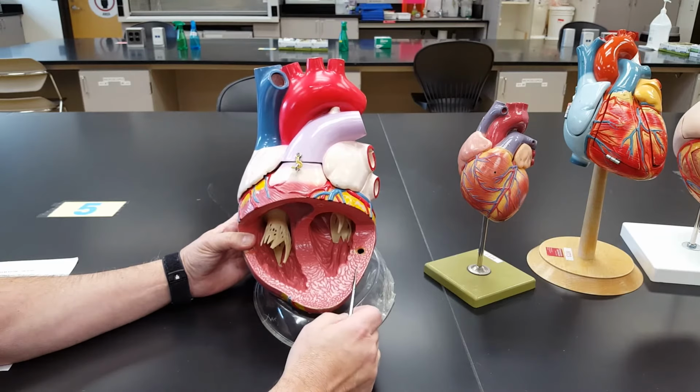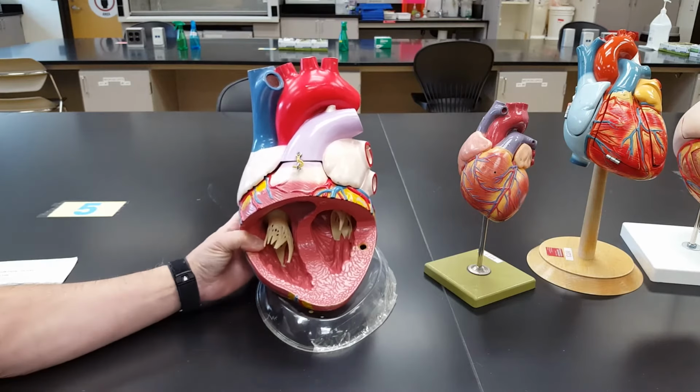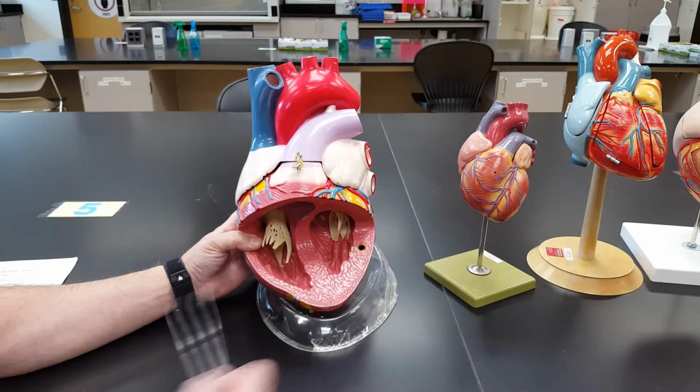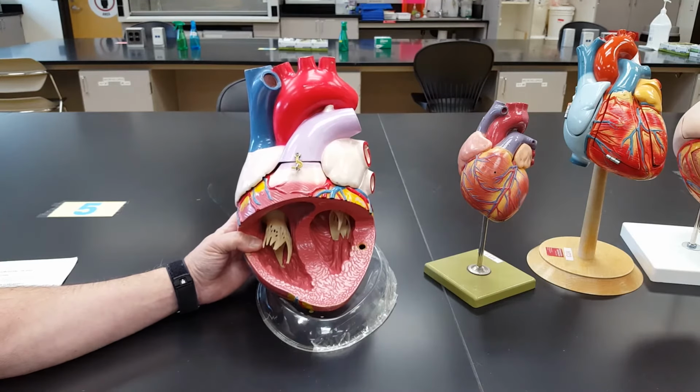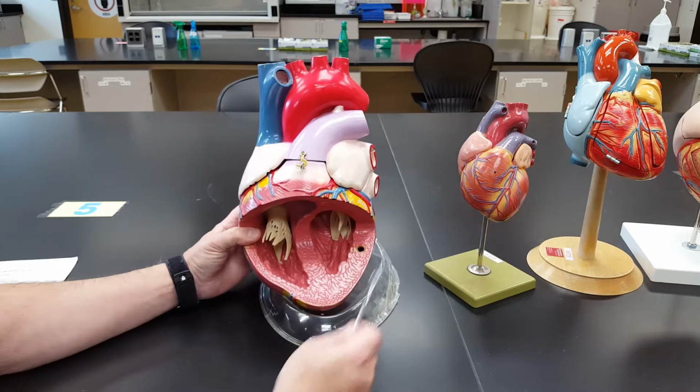I always recommend that you begin with the myocardium, which of course is more than 90%, about 95% of the cardiac wall is myocardium right here. So this is the muscle, myo, M-Y-O, meaning the muscle. So the myocardium is this thick layer right here that you see composed of those cardiac muscle cells you learn about and talk about in lecture.